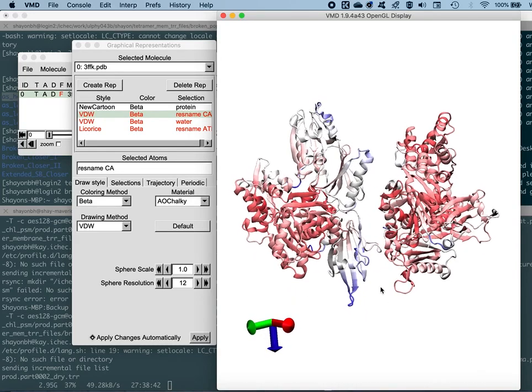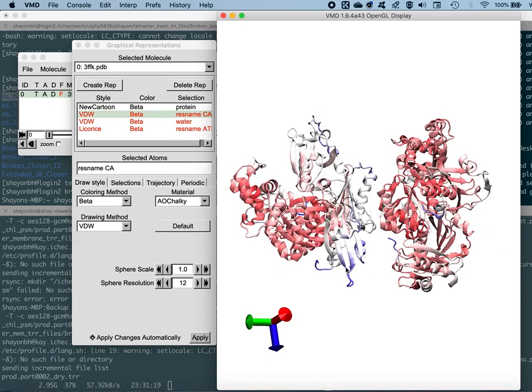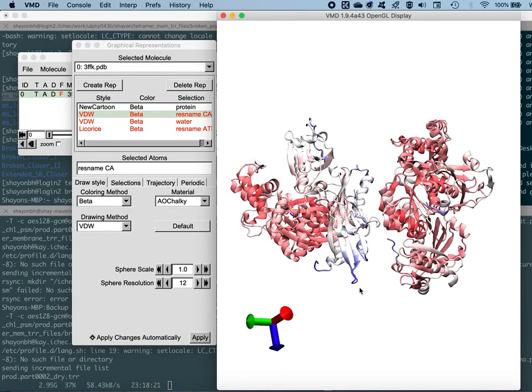All right. So apart from that, you find these regions which are exposed to the solvent to be slightly fluctuating. Okay, you have to keep in mind that the B values, or the temperature factor, usually ranges from 0 to 150. But if you go back to the PDB file in your text format, you'll find that these values are actually ranging up to a maximum of, let's say, 60 at the most, not more than that. So they lie somewhere in the middle. That's why you don't find the highest B value regions to be that bright a blue. So which means they're fluctuating, but not that much.